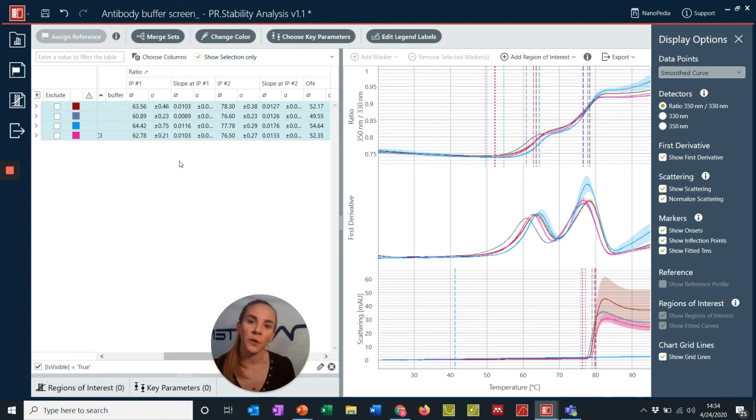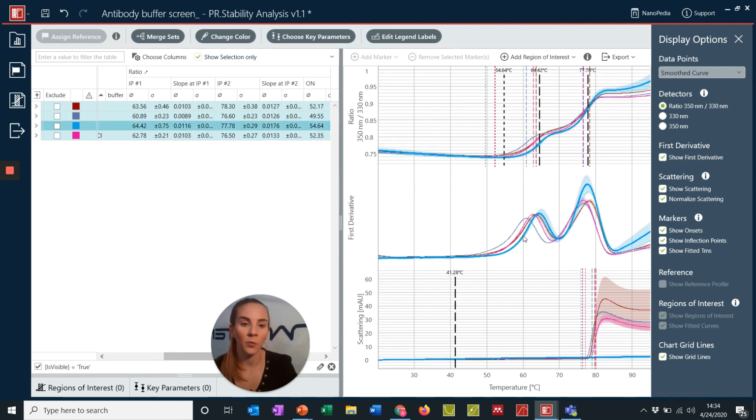So in conjunction with looking at onset of melting as well as inflection point values, you can now also use this value to assess the thermodynamic stability of your sample. This was something that traditionally you probably did by eye, looking at, say, the width of one peak in comparison to another. Say those samples had the same Tm values, however, one peak was more broad than the other. This is now a quantitative measurement that we no longer have to eyeball by looking at the unfolding profiles.